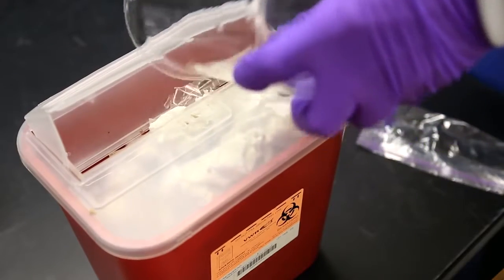Okay, back to safety. The most common lab injuries are cuts and punctures, and the most common source of those is cleaning up broken glass, which you should not do with your hands, but with a broom and a dustpan, and then deposit the results into a bin specifically for sharp stuff.